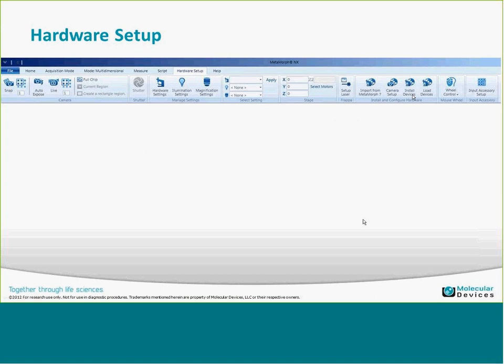This may look a little different if it's your first time seeing Metamorph NX. The application uses ribbons — you have active contexts across the top similar to menus, which open the different ribbons associated with that context. We're going to go through the hardware setup ribbon, specifically focusing on functions on the right-hand side of the ribbon.